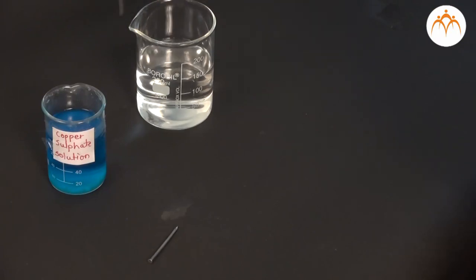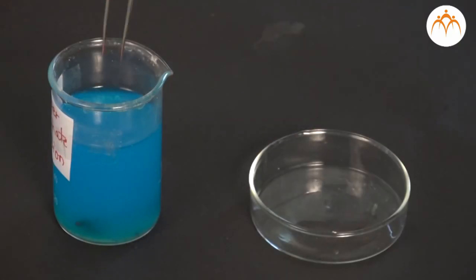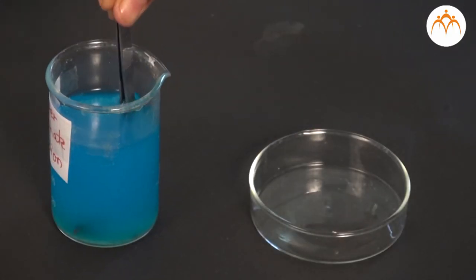Place the iron nail in copper sulphate solution for about 10-15 minutes. Remove the nail from the solution. Observe the change in the colour of the nail.